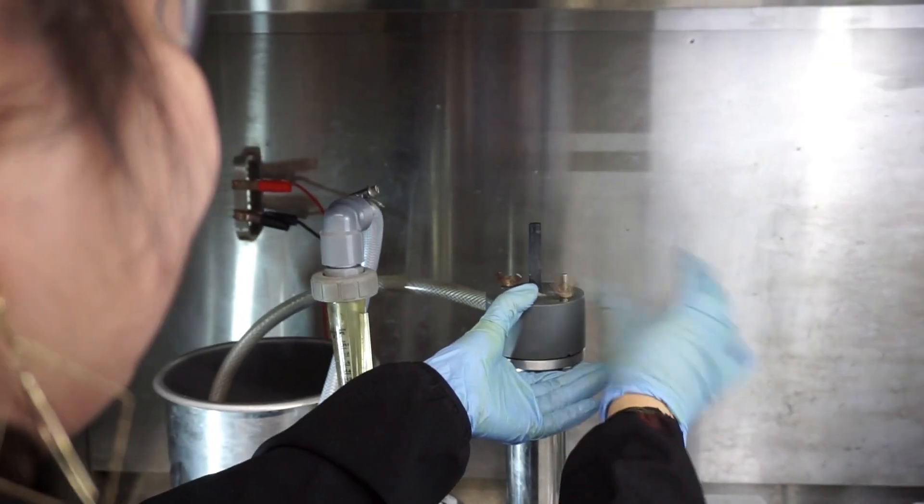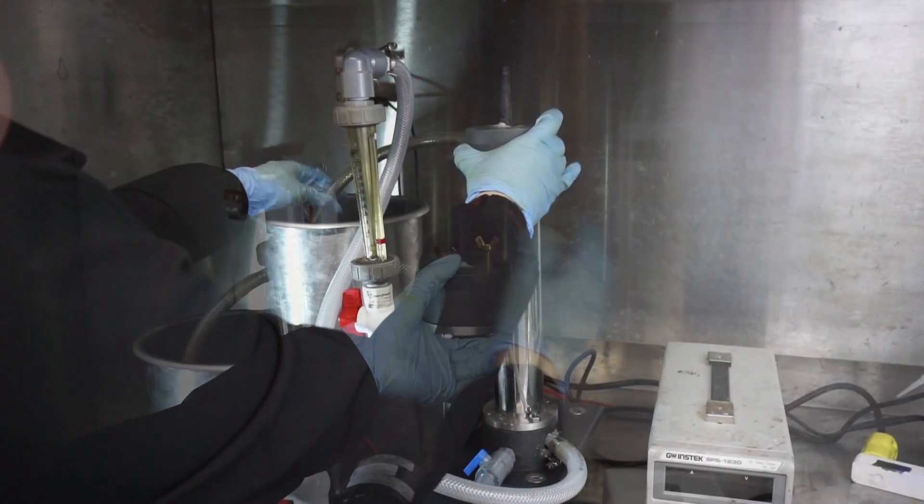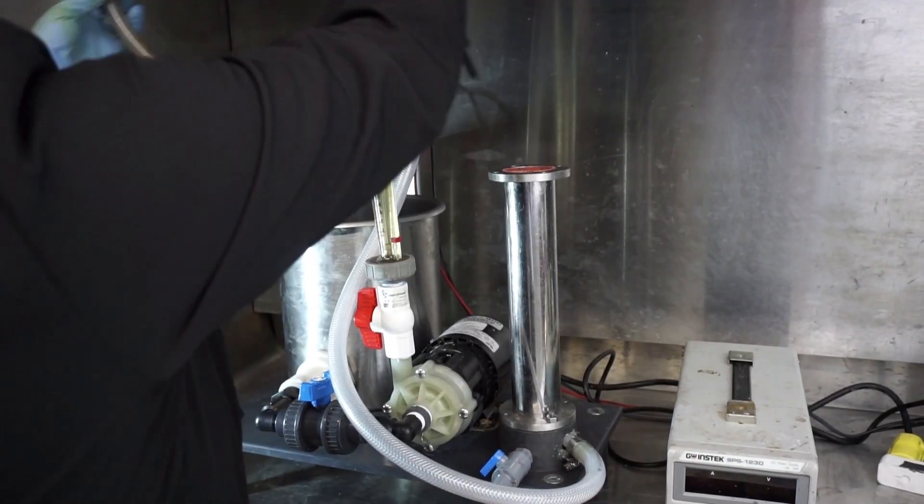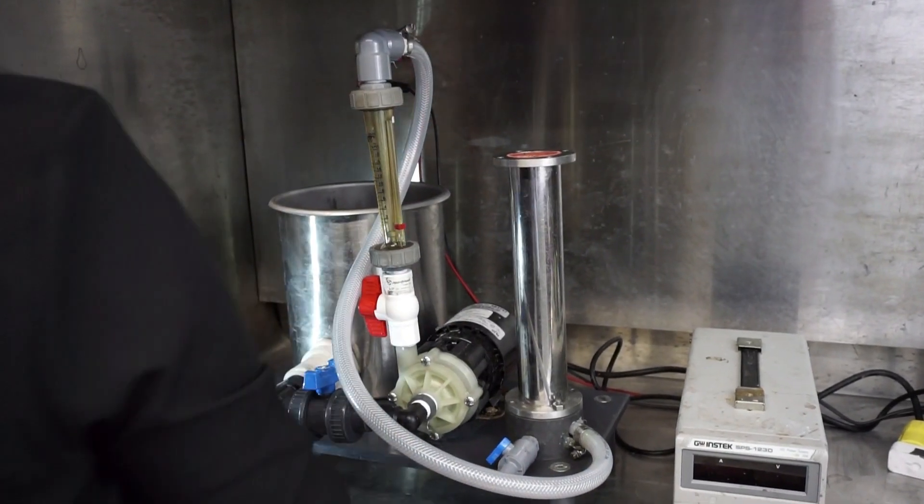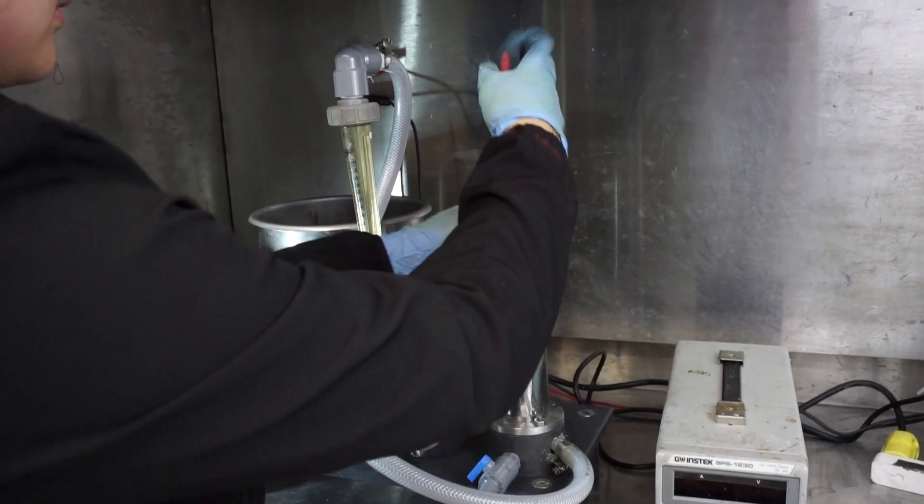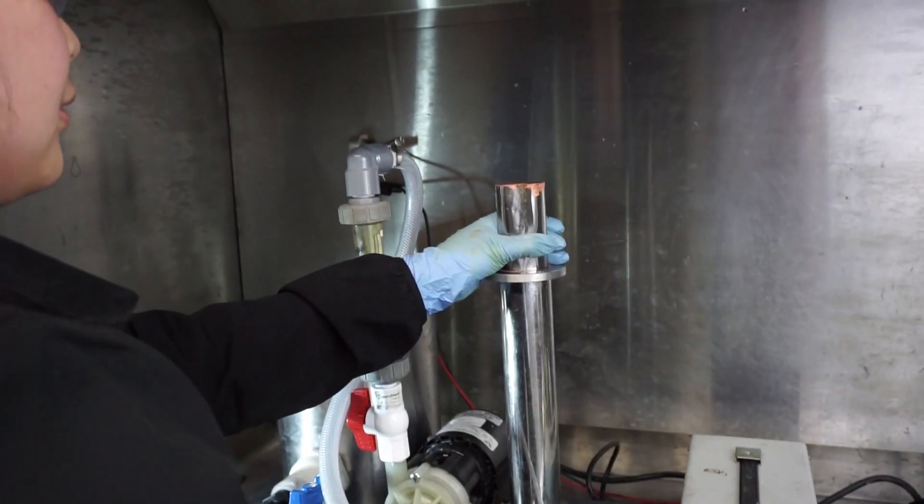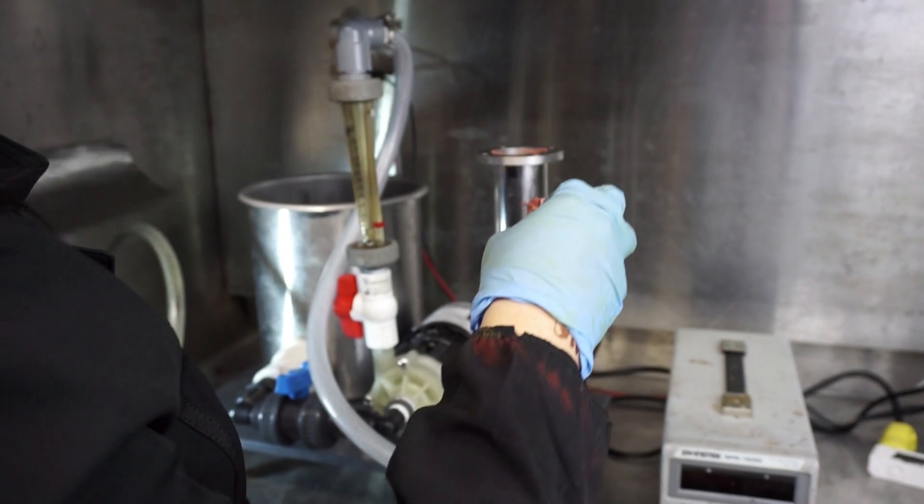After a given period of time with the current applied, the harvest begins. The rectifier is first switched off, followed by the pump. The system is partially drained, the upper end cap removed, and the starter sheet lifted out to reveal a brilliant high purity copper cathode.